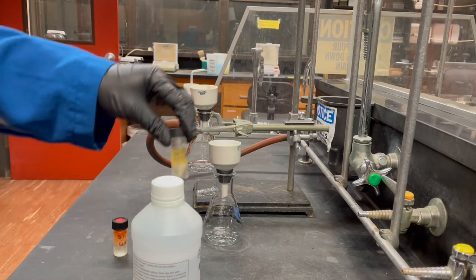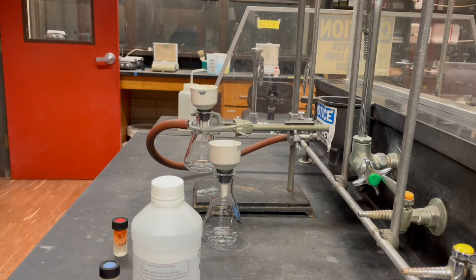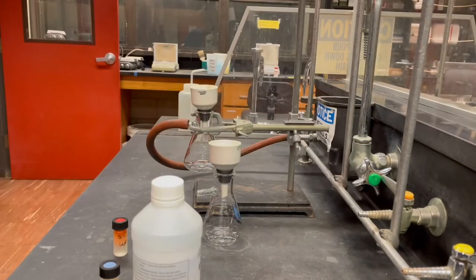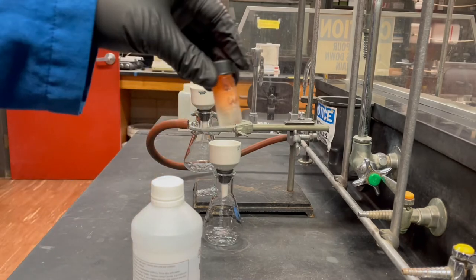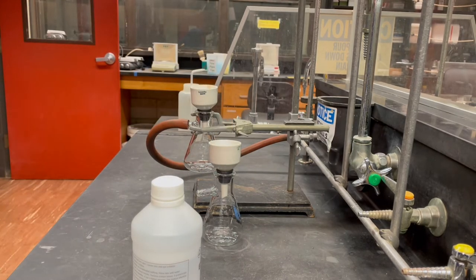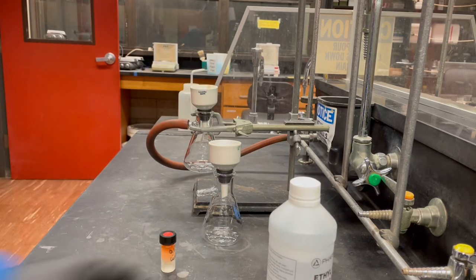I'm not sure if I ever did get to say it, because things have been a little crazy in here, but I added 0.15 mils of cinnamaldehyde to the stirring ylide. It was 0.15 mils of that mixed with a little bit of ethanol. I mentioned that the volume of this was really high, and that's because I ended up having to add more ethanol. I did add it a little bit more concentrated to this one. That's maybe also part of the reason why the color is that way. But I just wanted to mention that cinnamaldehyde, of course, is reacting with the ylide.